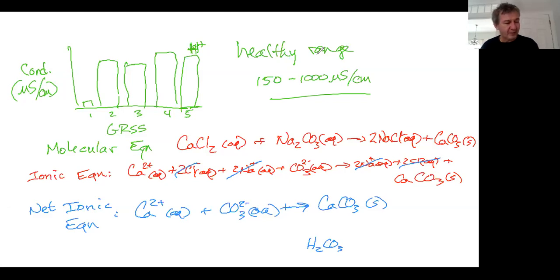And I think that in terms of the conductivity topics, that's really what you need to know to do the first half of this upcoming module, this experiment on conductivity in the Green River. So we're going to look at some standards first, and then we'll look at the Green River. And so that's the conductivity part.